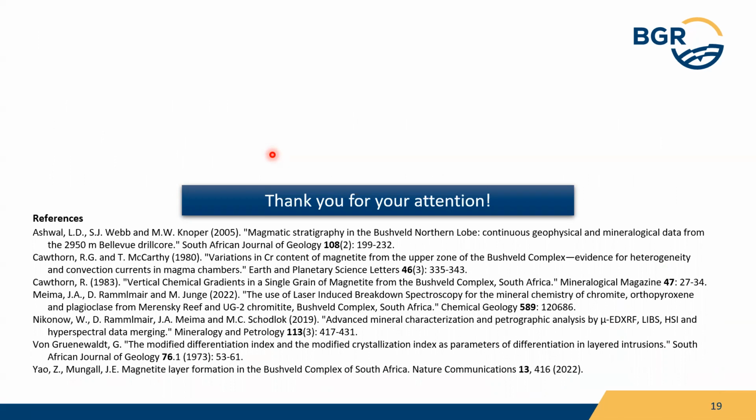And how long does it take to measure? It depends. If we use, for example, 20 micrometers resolution for a thin section, it takes about 3 hours for the microXRF. Okay. So after 3 hours, you have the measurement of the thin section. It's just 4 centimeters by 1.5 centimeters. Okay, thank you very much.